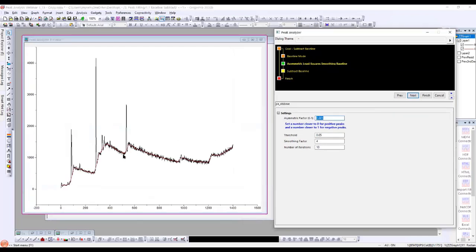The idea of this method is that the algorithm treats the data points on the curve differently. For data points below the baseline, we add more weight, and for points above the baseline, less weight. The entire data set is used to determine the baseline. It is an iterative process until it converges and finds the optimal baseline.